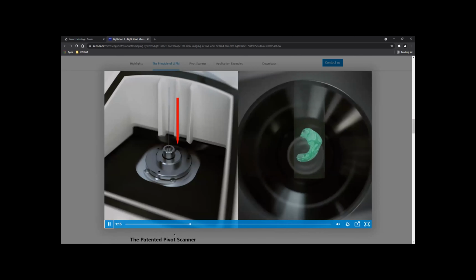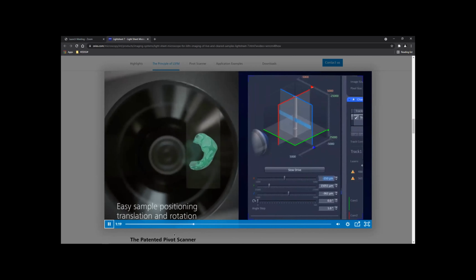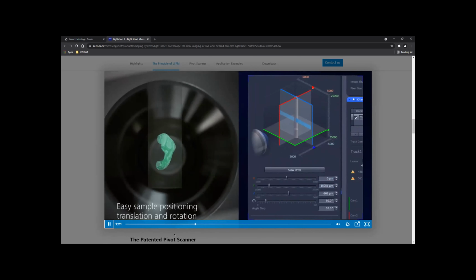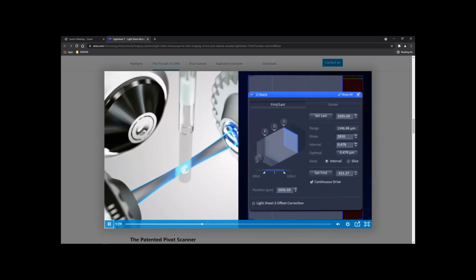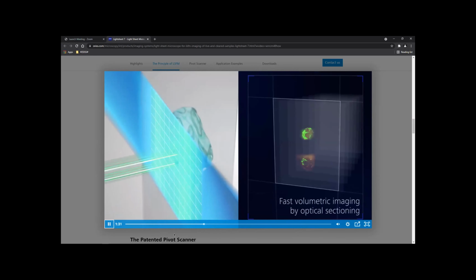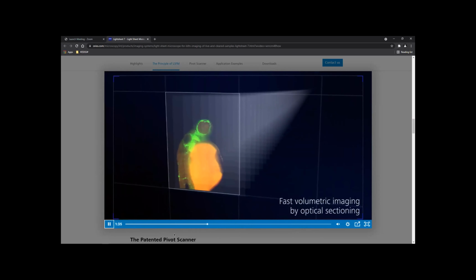Your fish or your specimen arrives in front of the detection lens. This is how you position it, left and right, and you focus it and you rotate it. And so this is how you do the first positioning, and then you go to the light sheet imaging part, in which you simply say, do a Z-stack through this, and while the Z-stack is being done, you can see that this fish now translates actively via the stage through the standing light sheet.